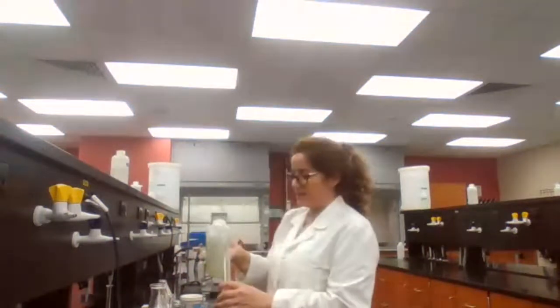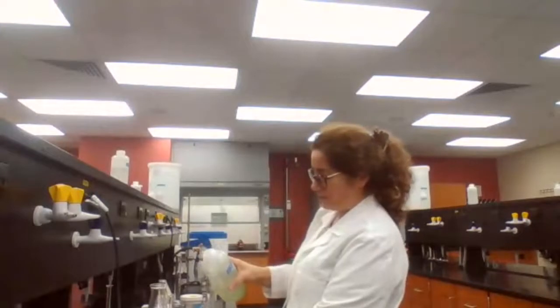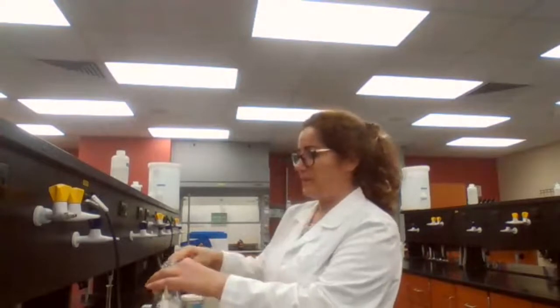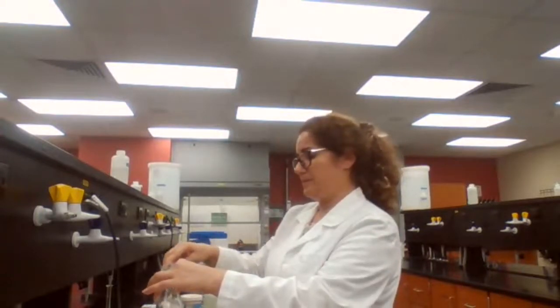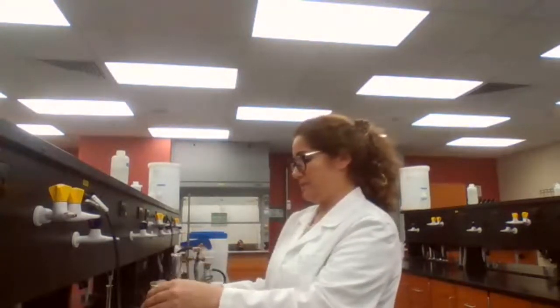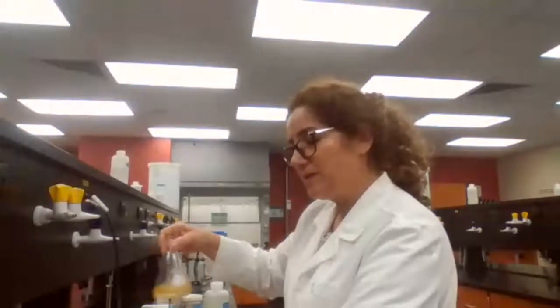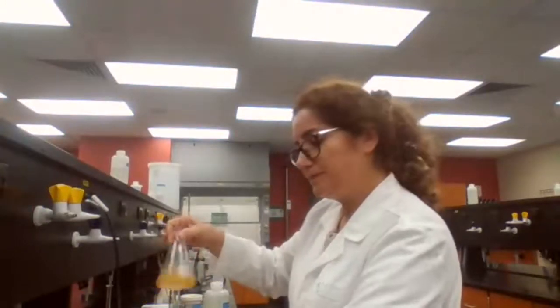What's next based on your procedure? Add 30 milliliters of water. Okay. Going to add 30 milliliters of water, and we are going to mix it well.